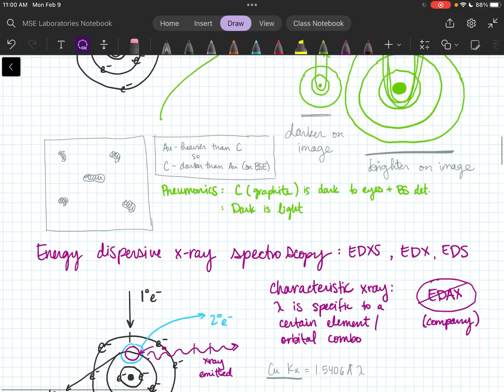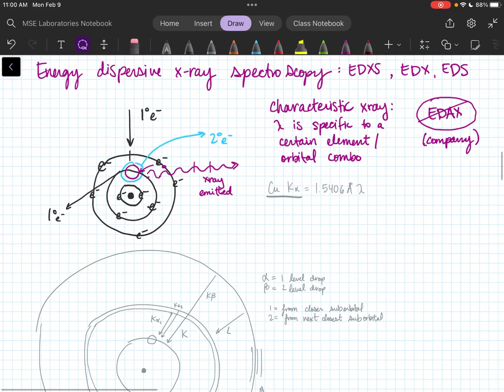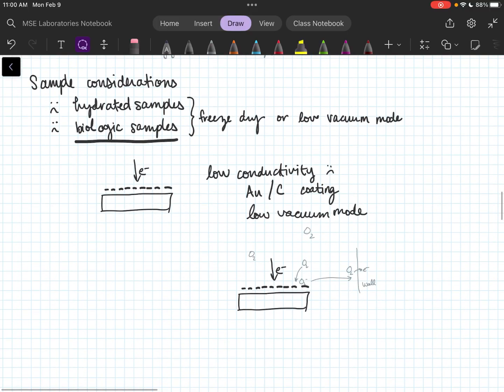So in metallurgy, we don't usually care as much about secondary. We're looking more maybe at the elemental analysis. Or we polish it and then we etch it, so we have a very specific topographical pattern. So that's a little bit more controlled. We call that metallographic preparation. And that's a whole separate conversation. But typically, SEM is good with most things as long as they are not going to struggle with the vacuum and not going to struggle with the conductivity.